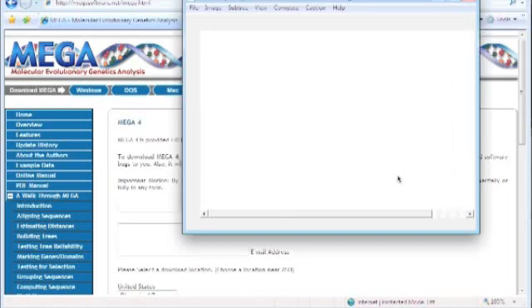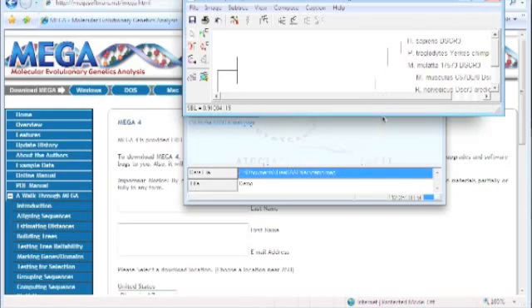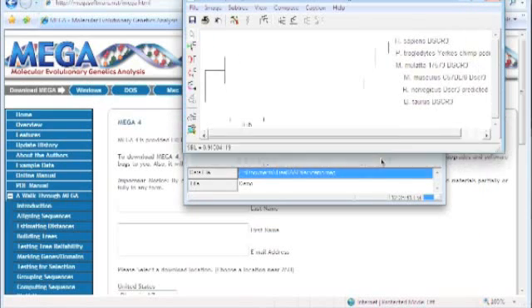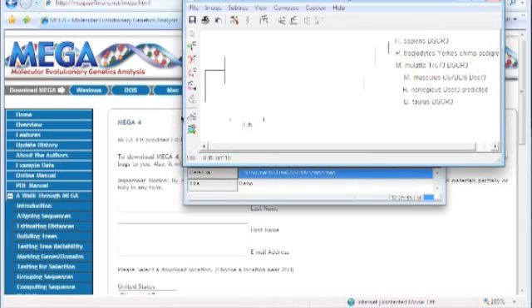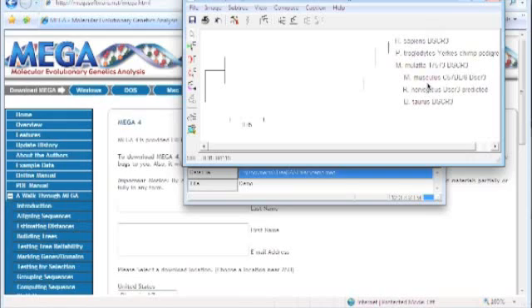It'll pop up the tree of the relationship. You can see here that the Homo sapiens — that humans are indeed most related to chimpanzees according to this. And the cow is the least related to the rest of these species, while the mouse and the rat are kind of close together. When you get a tree like that, it's a good sign that your data is pretty good and that things are working.